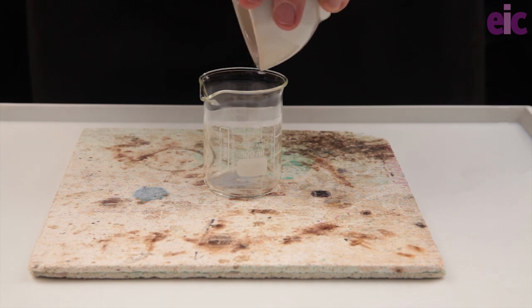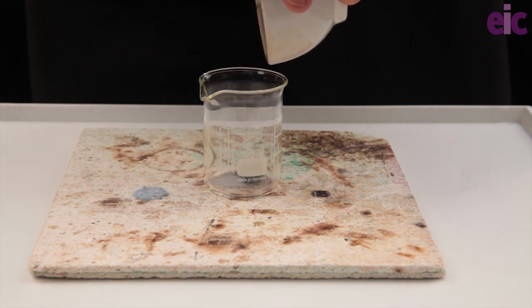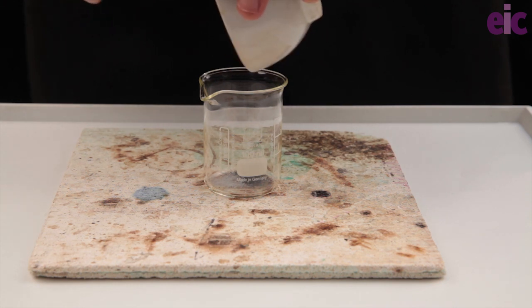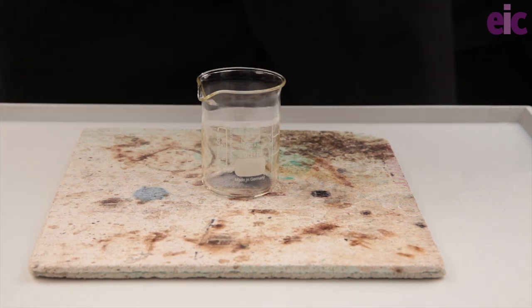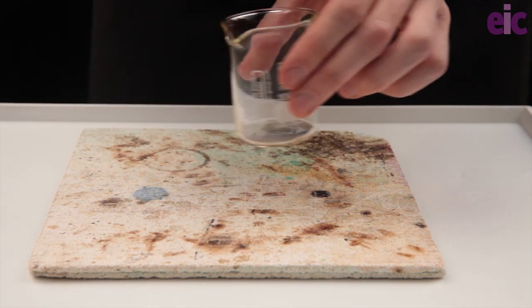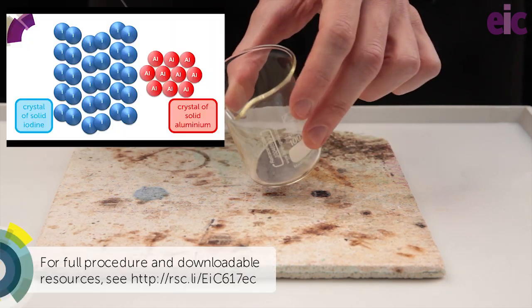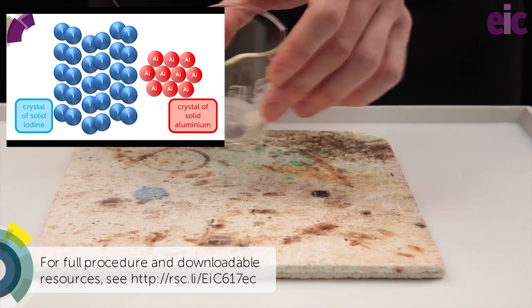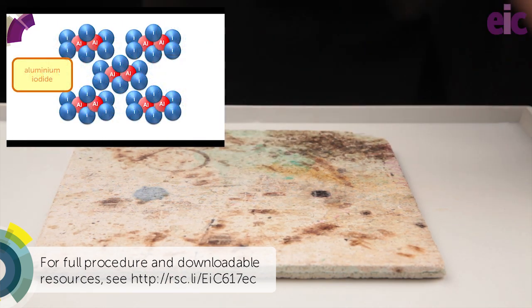Notice the difference in the appearance of the elements. The aluminium is a pale grey powder and the iodine is much darker. When we mix them, as we would expect, we see a shade between the two with visible darker and paler patches. This is evidence that we still have the original materials there, just mixed together. Particle diagrams like these can be downloaded from the EIC website with supporting information on this demonstration.